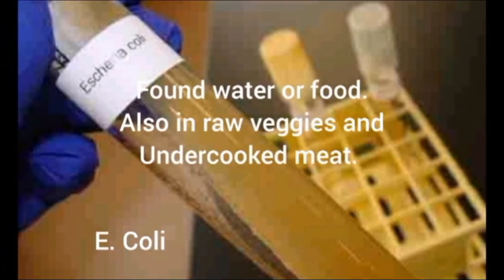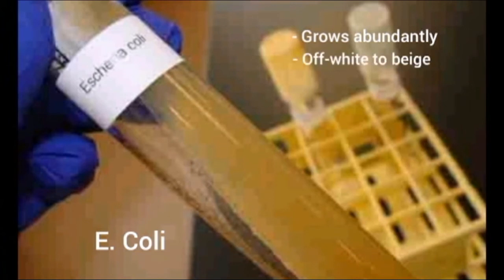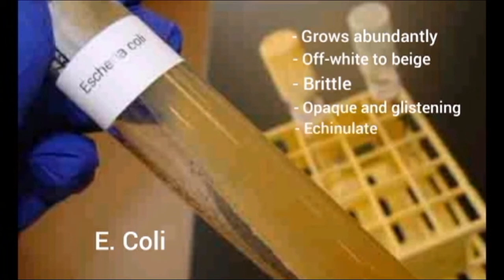Another example of a bacteria is the E. coli, found in water or food, raw veggies, and undercooked ground beef. They grow abundantly since they are fast growers. They come with an off-white to beige color in colony. They are brittle also. And they are opaque and glistening, which means they are glossy. Their form of growth is echinulate, and their odor is like a stench odor.